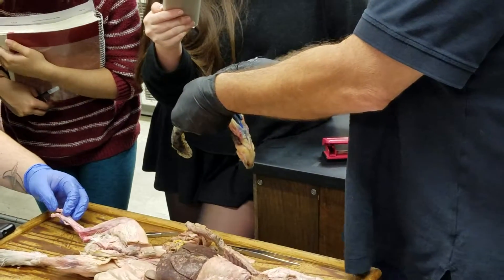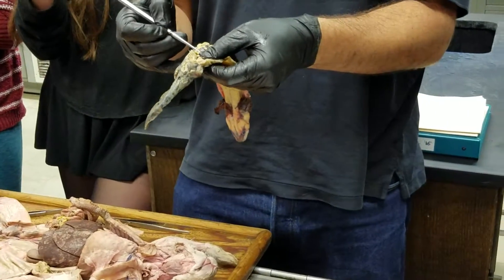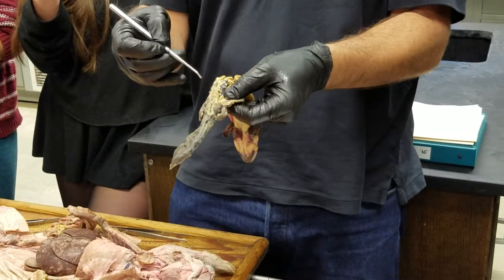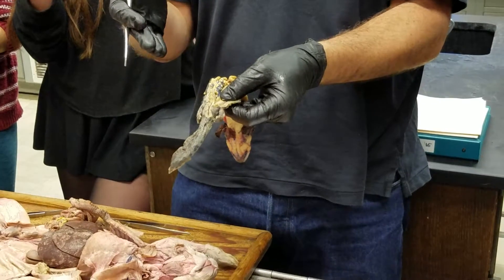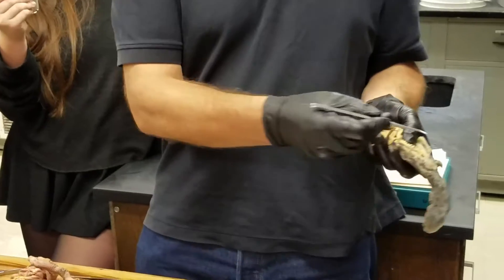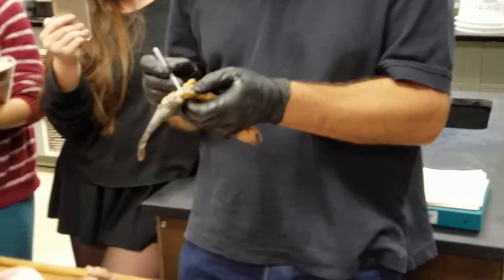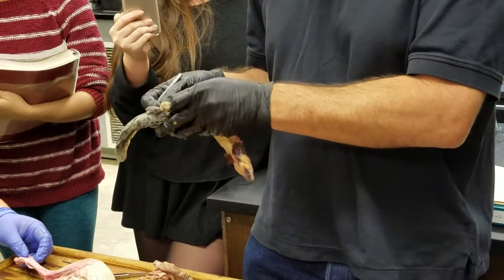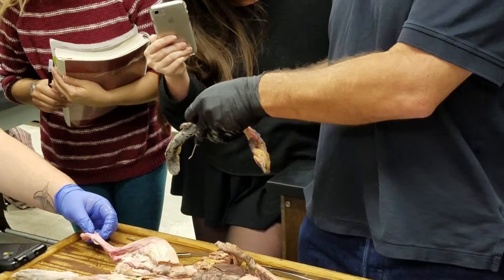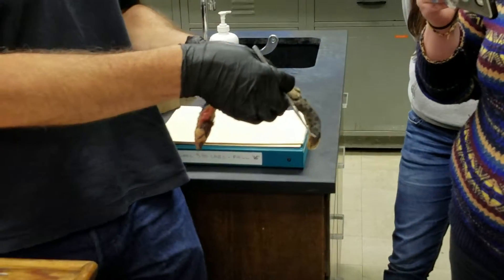There is an archonephric duct — I'm not going to try to show it — but it runs right along the lateral border of the kidney, medial to the oviduct. Notice that there's not a swollen cloacal region in the female. And there is this big sac that extends ventral to the gut and everything else — that would be the bladder.